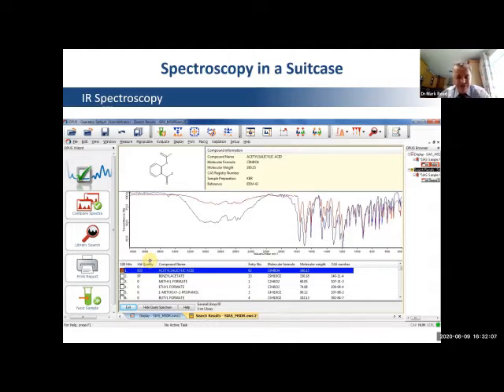So it's a very useful technique. Now, obviously, I'm sure you've been taught not to believe everything that comes from a computer. You've got to see, does that make common sense and chemical sense as well? Because obviously, if your compound isn't in the database, it won't pick it up. So you have to be sure. You also have to look at the spectrum. Are they overlaid? Does that make sense? And in this case, I'm confident that it is. And so our sample is indeed aspirin.